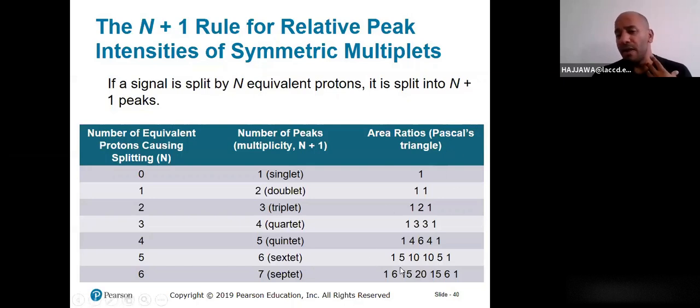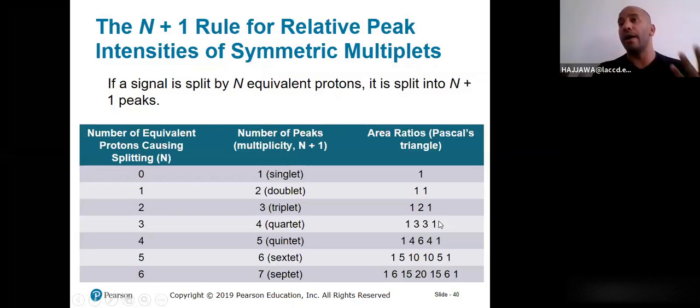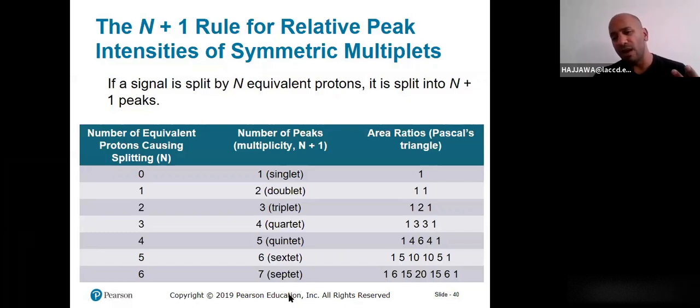Most of the time, it becomes important how I draw the peak if I'm asked to predict an NMR spectrum for a certain structure. But I will be lenient in regard to drawing the signal splitting. Most of the time, I will be asking you to match the structure or predict what the structure is going to be for the corresponding spectrum. So I don't think I'm going to be asking you to draw an NMR spectrum.